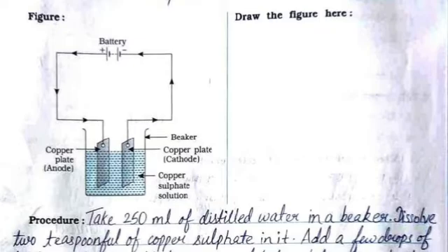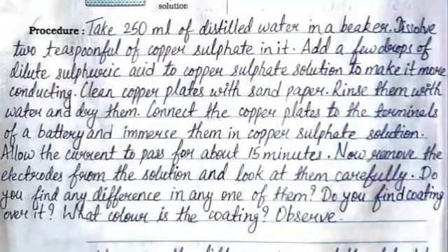You need to draw the same figure on the right hand side where space is given. The procedure: take 250 ml of distilled water in a beaker, dissolve two teaspoons of copper sulfate in it, then add a few drops of dilute sulfuric acid to the copper sulfate solution to make it conducting. Clean the copper plates with sandpaper and rinse them with water.